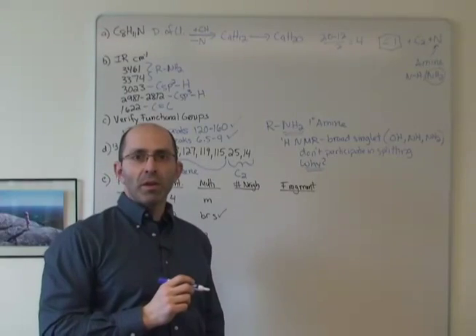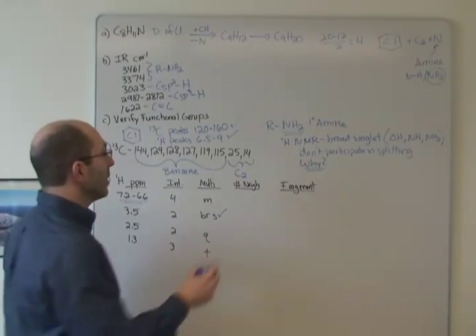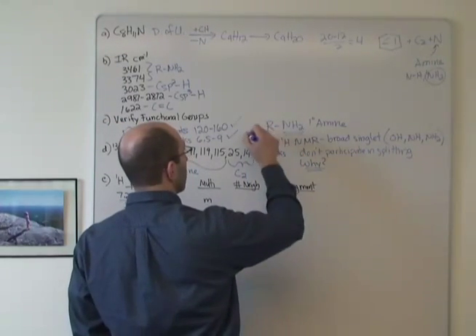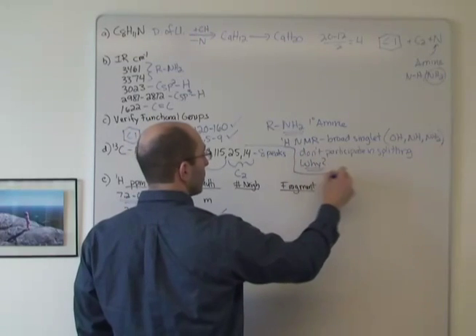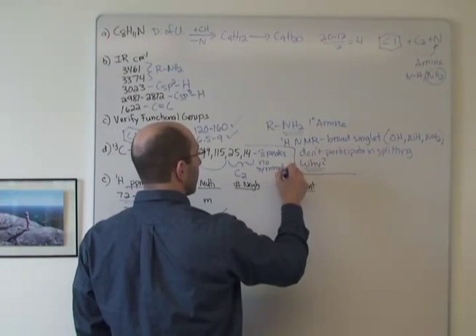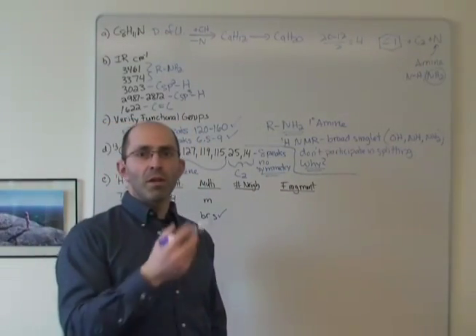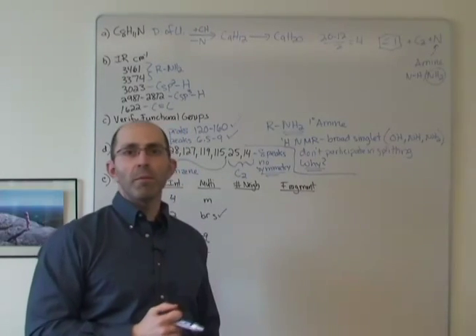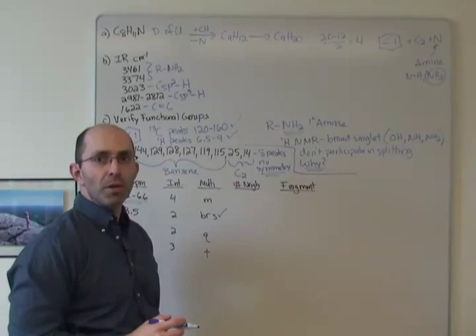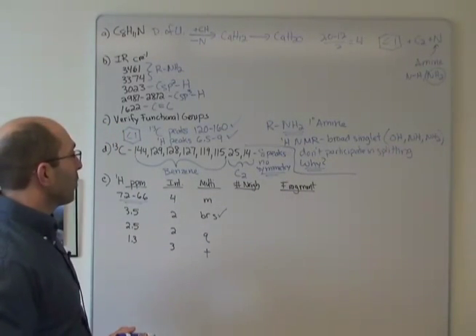The really important thing at this point is to recognize that we have no symmetry, right? We have 8 peaks. There's no symmetry. All right, that's important. Because remember, if we have fewer peaks than a number of carbons in our molecular formula, that means there's some symmetry involved in the molecule. So for this molecule, we don't have any symmetry. All right? So we've learned a lot without even looking very much at the proton NMR.